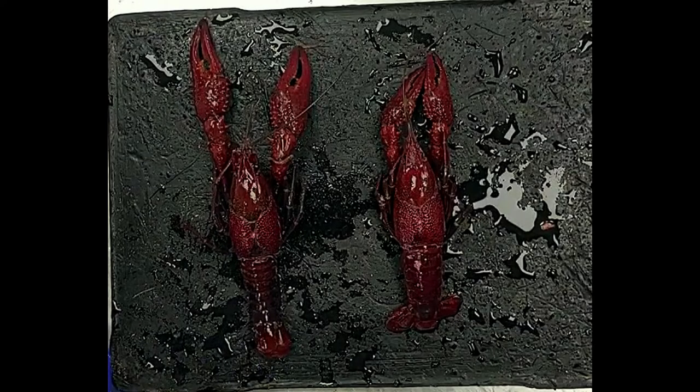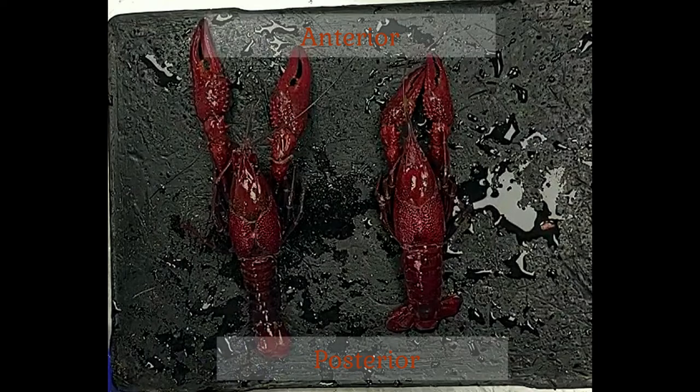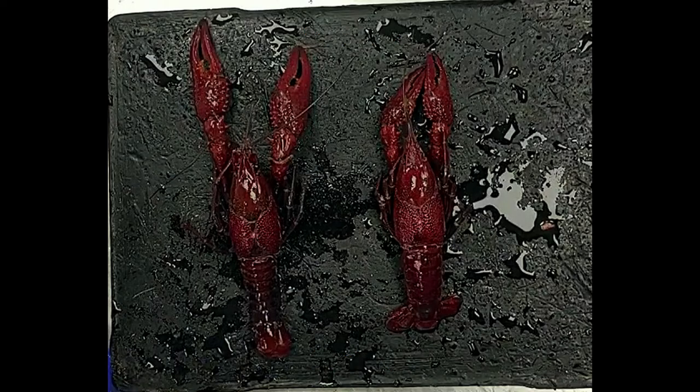Here we have our more moderately sized dissection specimens: two freshwater crayfish in the genus Cambarus. Already as we look at them, we can see that it may be a bit easier to figure them out than it was with the molluscs, because we can already tell which is the anterior end — the head end — which is the posterior end — the tail end. We also know that the dorsal surfaces face up and the ventral surfaces face down.